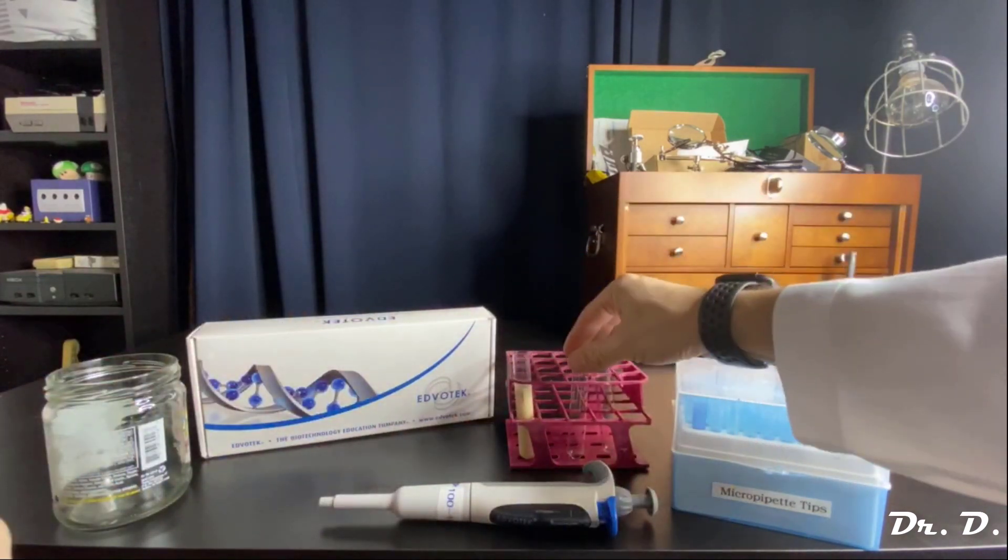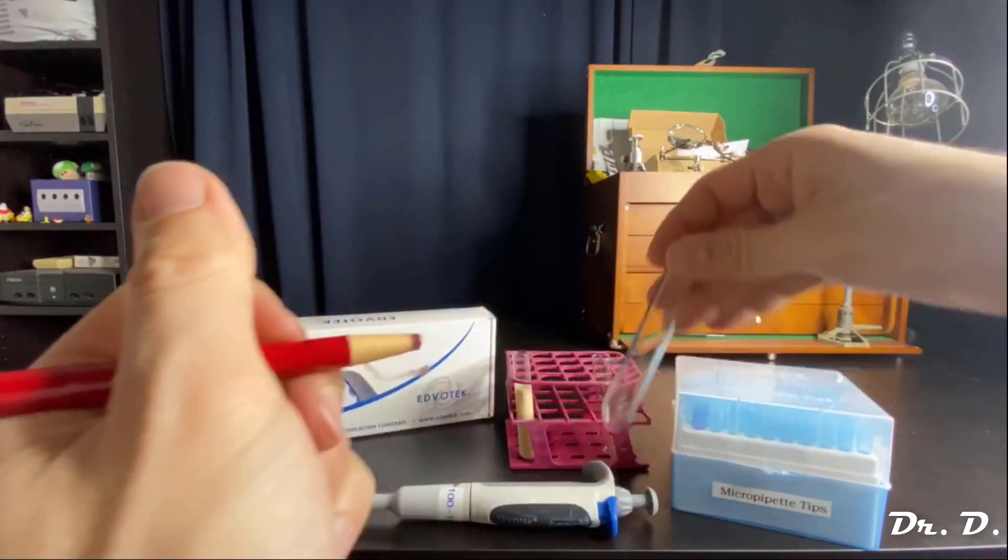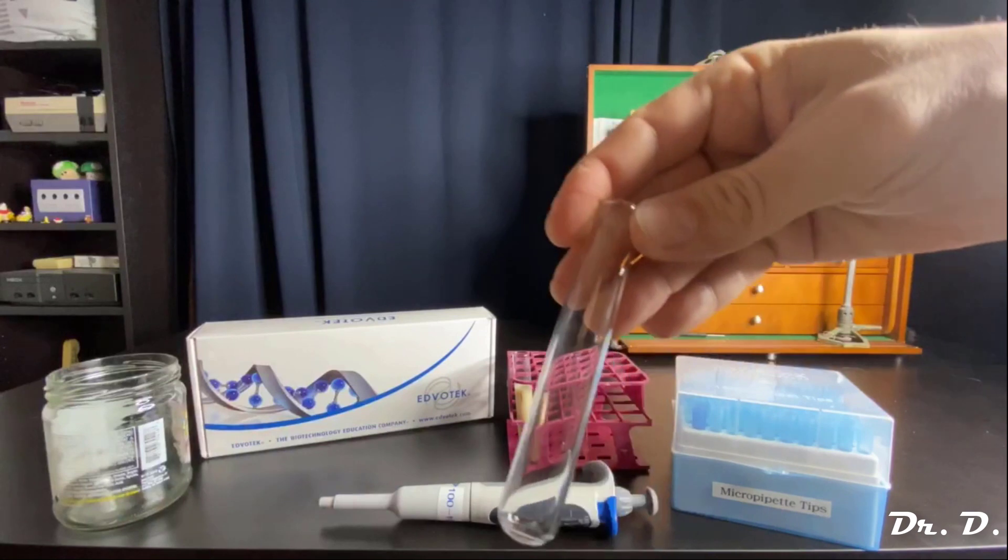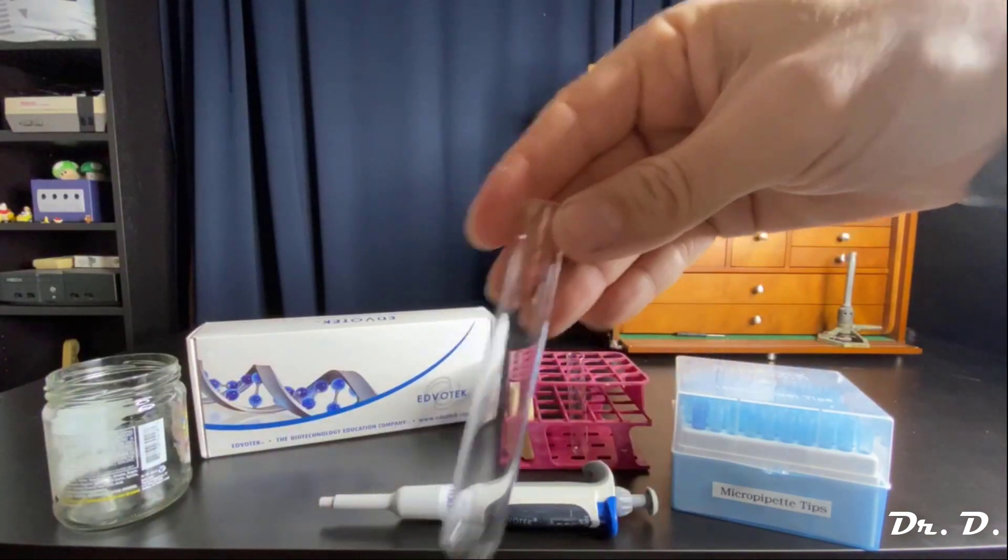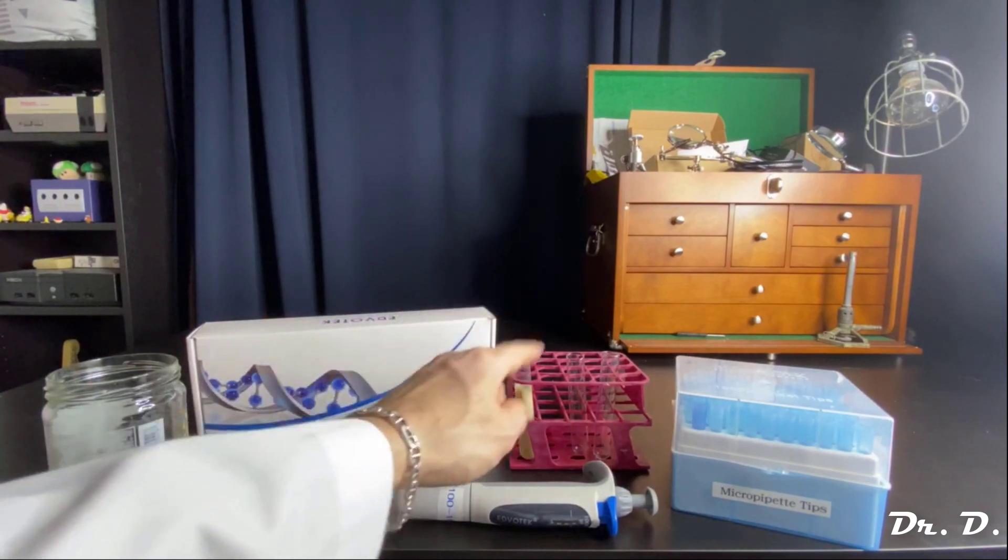So I could write test tube one here. I could write test tube two or three or whatever you want to do. A, B, C. There's two. My handwriting is pretty terrible today, but that's fine. I can see what I want. That's tube three. All right. So I've now marked my tubes one, two, and three.